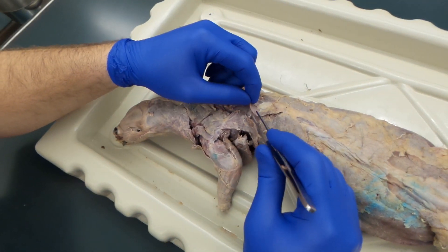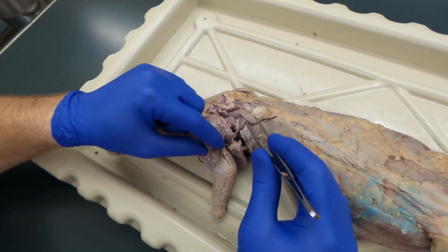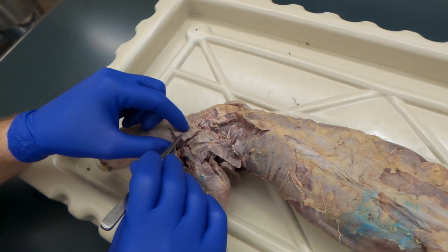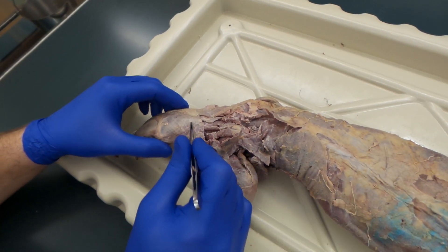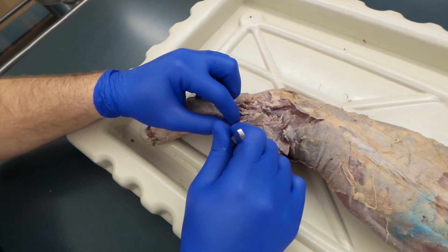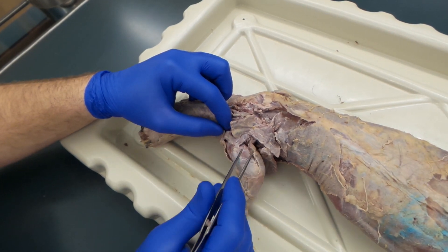Last week you dissected the trapezius muscles, so here we have our spinotrapezius, acromiotrapezius, and then you have your levator scapulae ventralis, clavotrapezius. Take that levator scapulae, kind of draw a line, and you're looking at the clavodeltoid, acromiodeltoid.